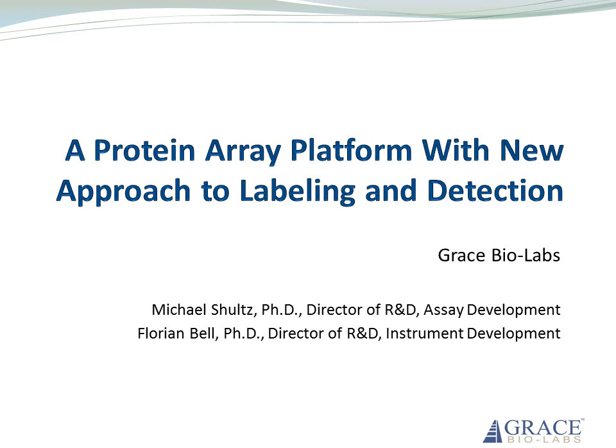Today we will be discussing a protein microarray platform centered on the use of porous nitrocellulose film slides. Nitrocellulose offers significant advantages for numerous protein array applications, and today we will discuss the advantages of using this binding surface compared to other popular microarray surfaces. Subsequently, we will also introduce you to an alternate approach for labeling and imaging protein arrays, which work synergistically with the properties of porous nitrocellulose.